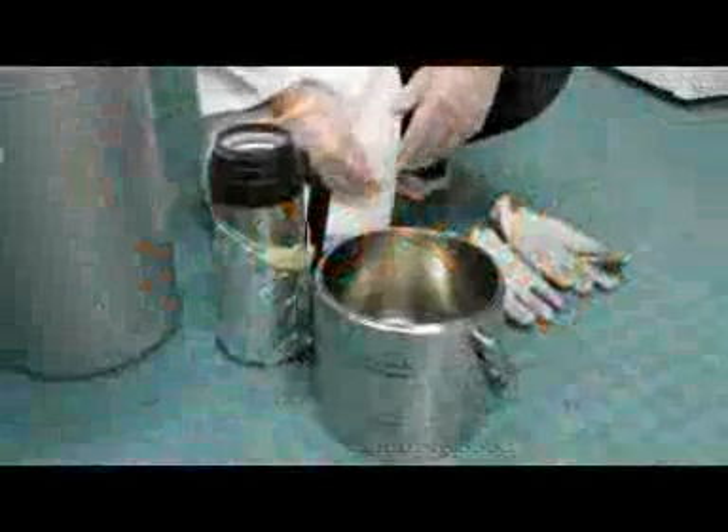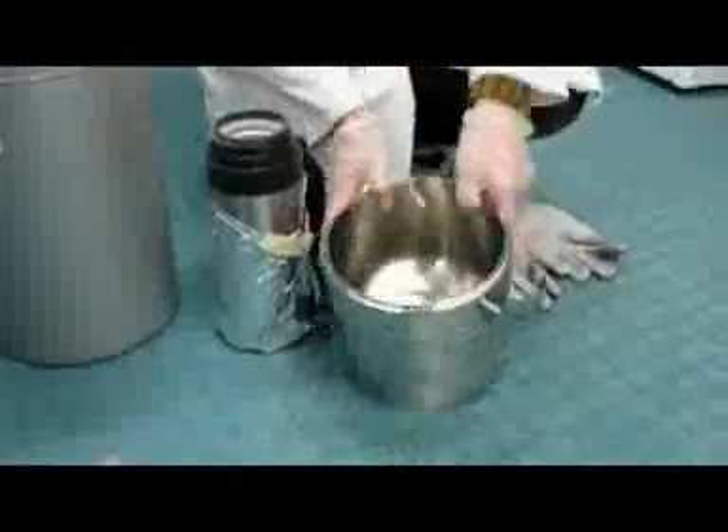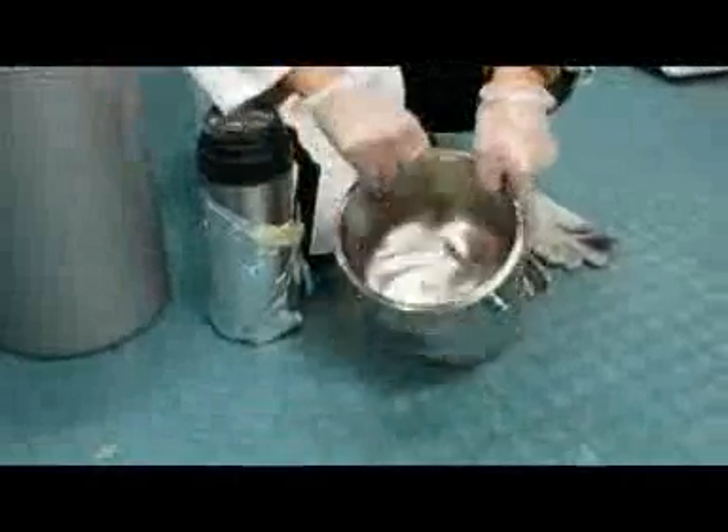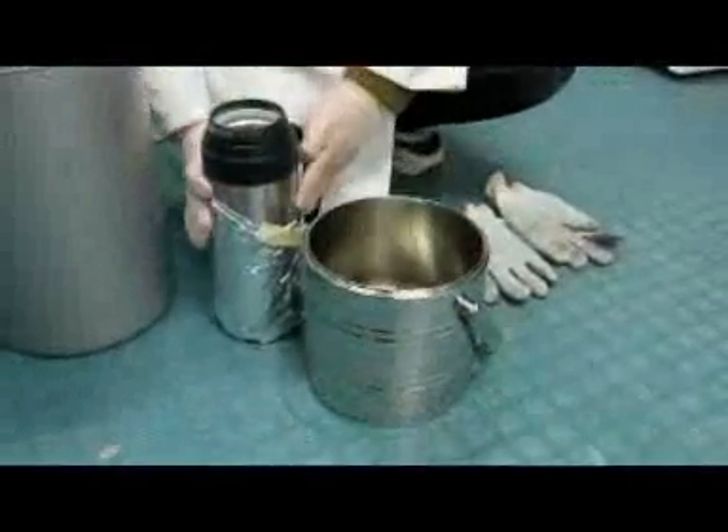Hello fellow nerds, today we'll be freezing acetone with liquid nitrogen. Here's the acetone — a simple organic solvent, pretty easy to get actually. And this is liquid nitrogen.